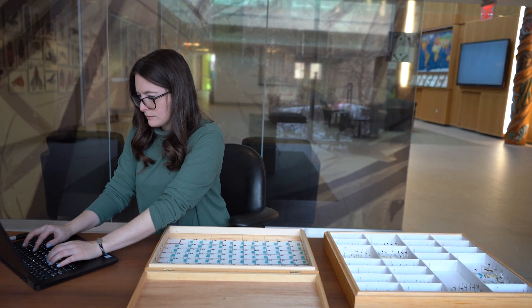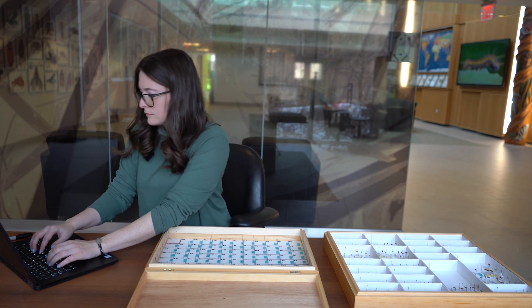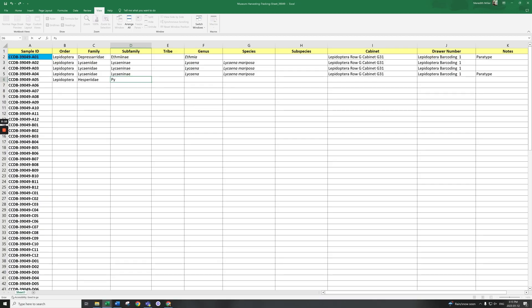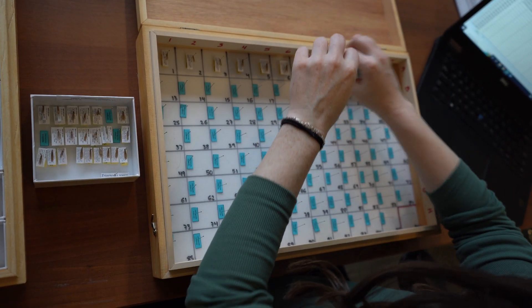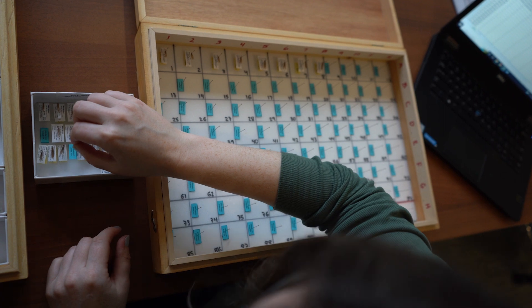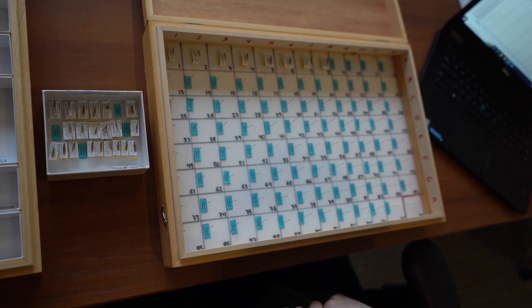The label ensures that each specimen can be returned to the correct location in the collection after processing. Fourth, after selecting an appropriate specimen, fill out the museum harvesting tracking sheet. Be sure to note the cabinet and drawer number where the specimen came from, and any other useful details to keep the process organized. Fifth, continue working through the collection until you have filled the gridded array box with 95 specimens, while well 96 is left empty as a negative control.